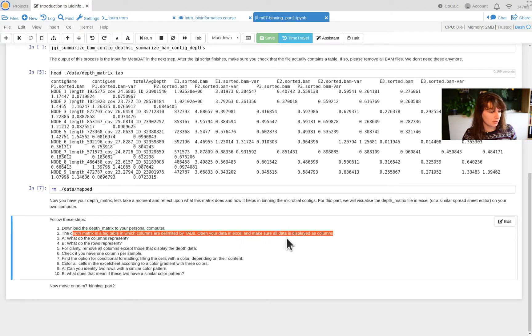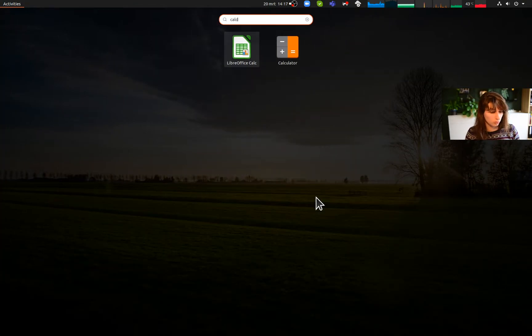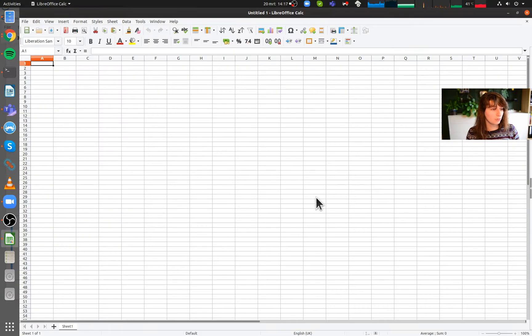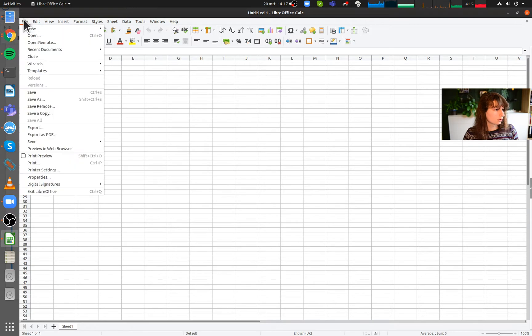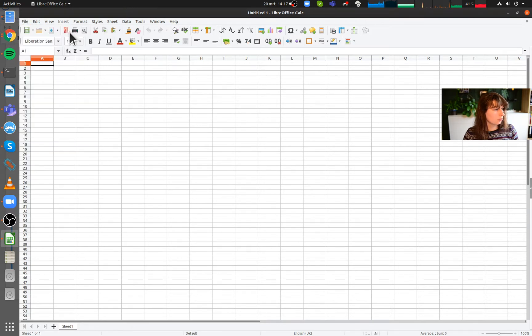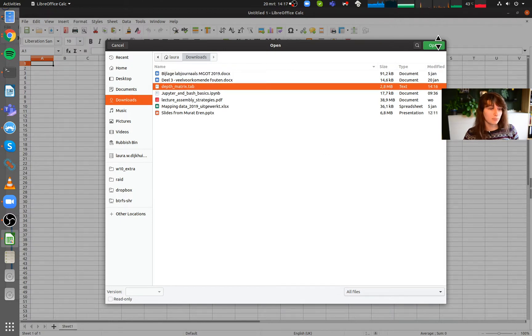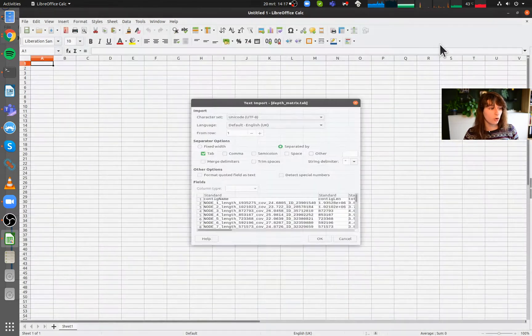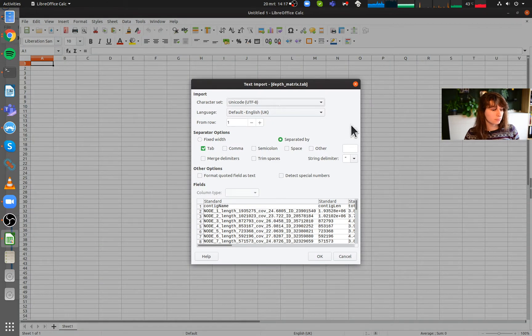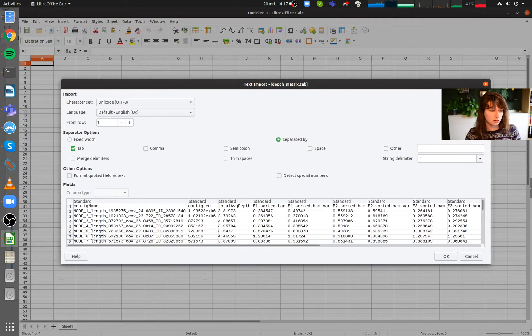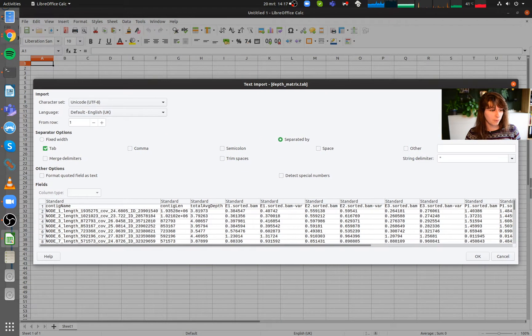The instruction says: open your data in Excel and make sure all data is displayed as columns. I'm on Linux, so of course there is no Excel, but I have the open-source equivalent. I'm going to open the file that we just downloaded — go to Downloads, find the matrix, and open it. In Excel you get a similar pop-up.